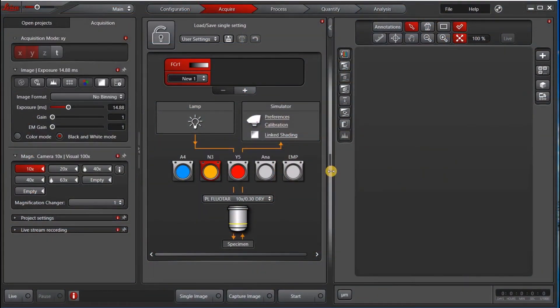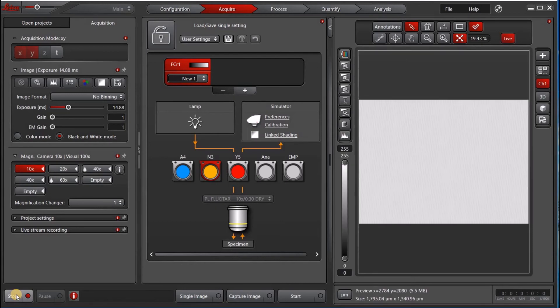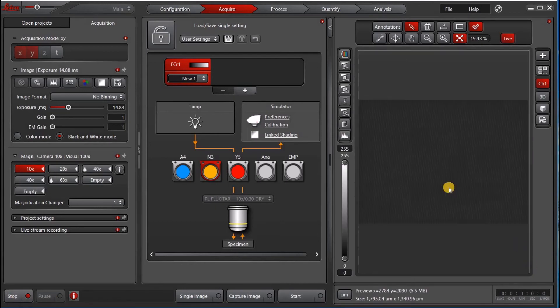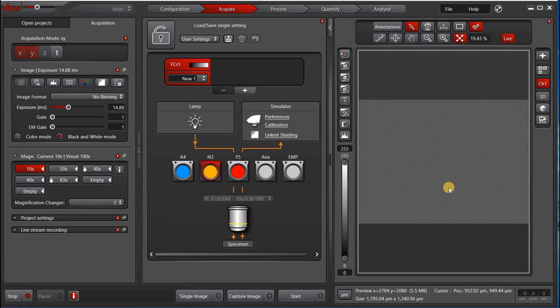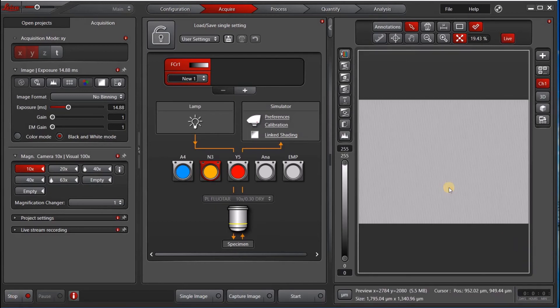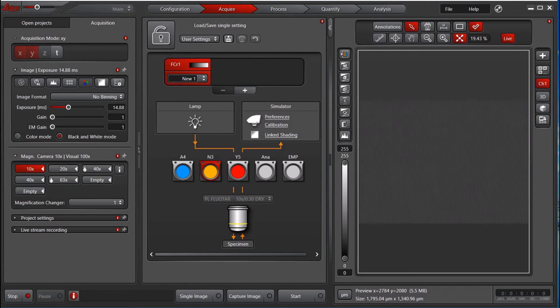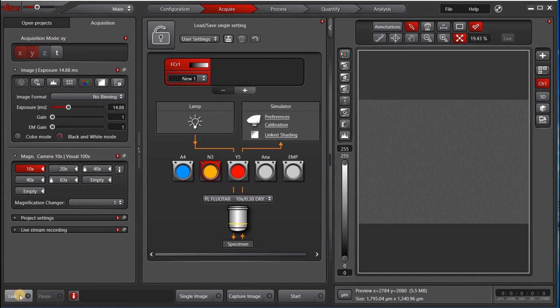So then LASX will load with a simulated microscope and a simulator camera. And if you try to use any of the acquisition, it will give you these kind of images. Sometimes there are some stock images that will load. But you can go ahead and use the rest of the software for processing and browsing.